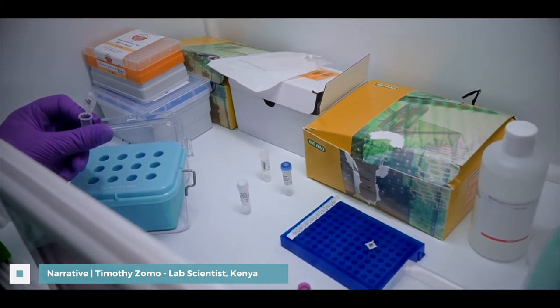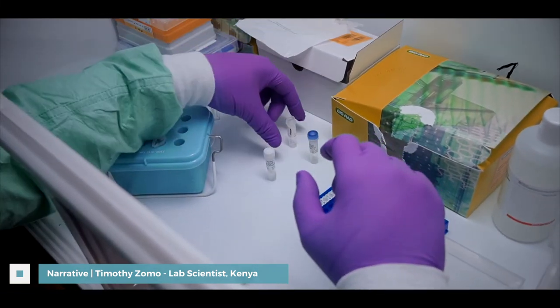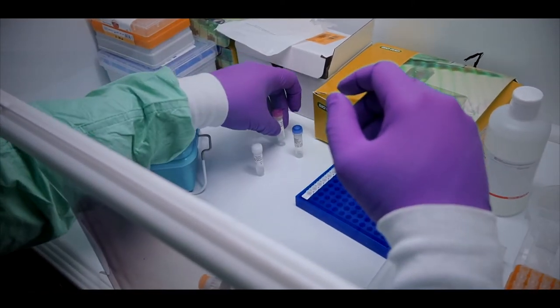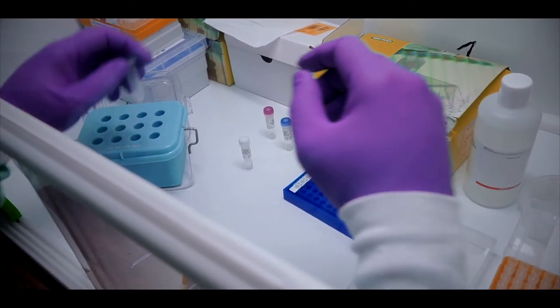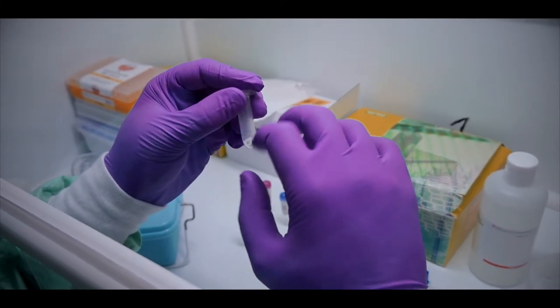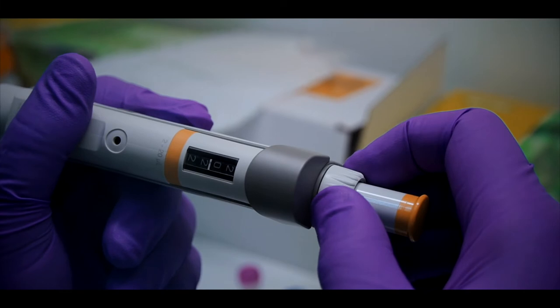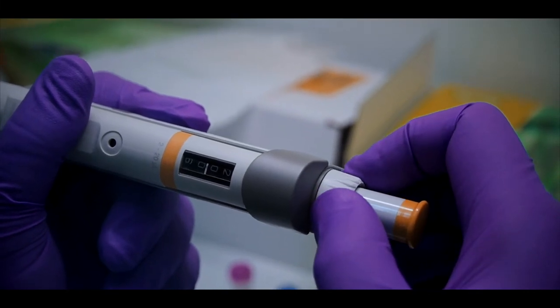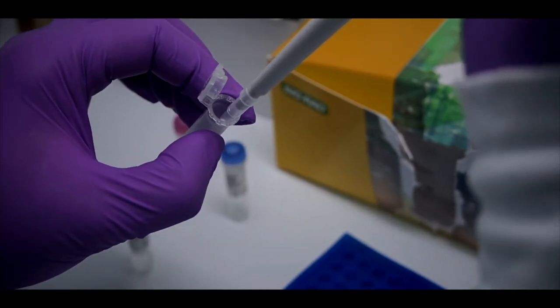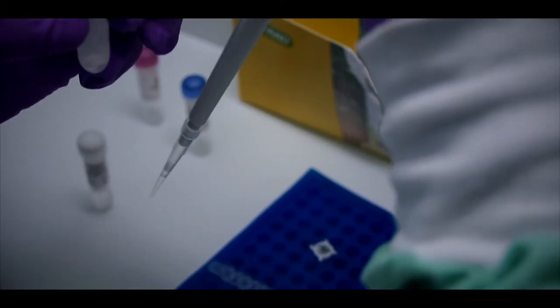We are preparing what we call the master mix. We have two tubes labeled master mix A and master mix B, and we are combining both master mixes in one tube before dispensing them into the PCR tubes in the appropriate volume of 20 microliters. He is now adjusting his pipette to the appropriate volume and dispensing the master mix into the various PCR tubes depending on the number of samples.